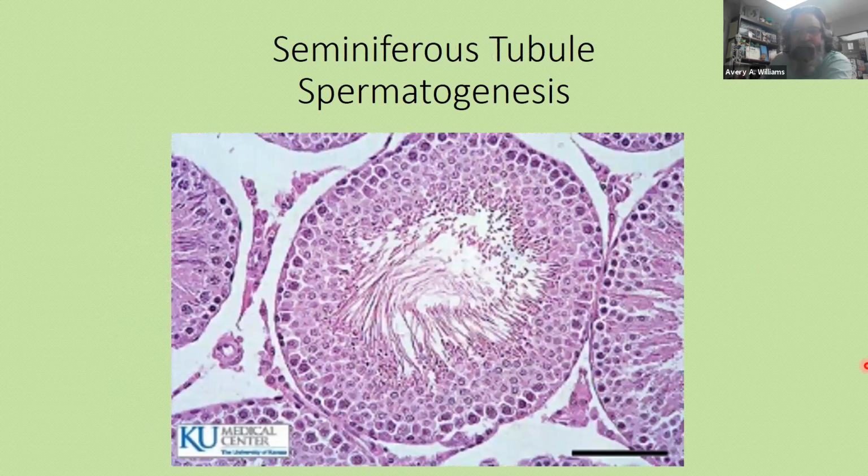There we go. Here's a zoomed-in seminiferous tubule. Okay, you can see it's hollow in the center, and then you see the wall of it is made up of a bunch of cells. And these cells are undergoing nuclear division, or karyokinesis, right? But reduction division. When we're talking about reduction division, you're talking about reducing the number of chromosomes. And that's meiosis. Meiosis, reduction division, same thing. Or the karyokinesis and the formation of sex cells.